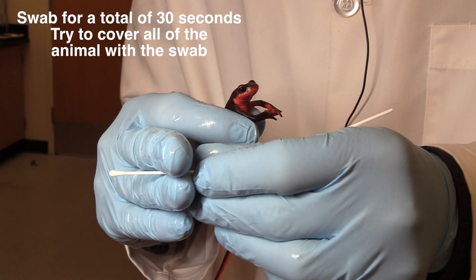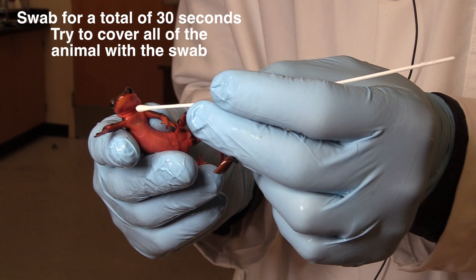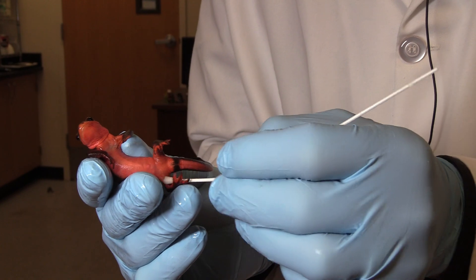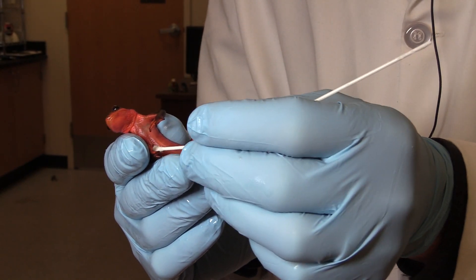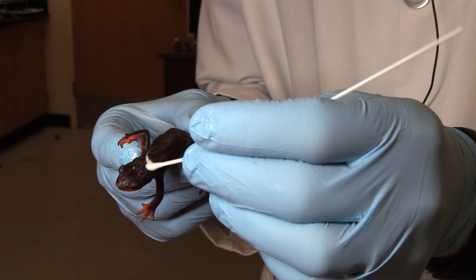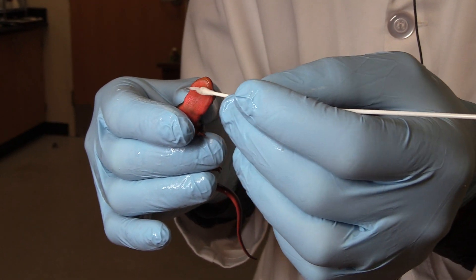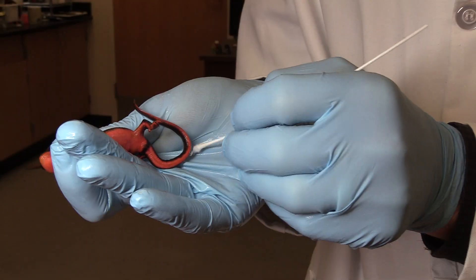The protocol calls for swabbing him for 30 seconds. I'm going to try to hit all of his body as I do it. I want to do it hard enough to actually pick up those bacteria or fungi that live there, but soft enough where I don't hurt the animal. I'm going to try to get through the vent area, as well as all through his little digits, the top of the body and the bottom. Notice how rough he is up here. It's okay if that swab comes undone a little bit. I also want to get up around the face and the nares — be really gentle there. The sides, and I'm also going to get the tail.